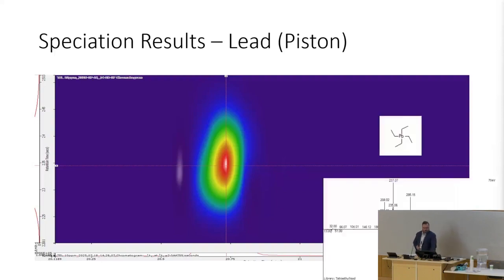It is, for its location in your chromatogram, basically one of the best peaks I've ever had to work with, because you're never going to confuse it with anything else. It's so early, because it's got a low boiling point, but its structure is just so different. When you look at the mass spectra, you have your molecular ion and then you just have lead losing ethyl groups in these really, really defined peaks. So it's super, super nice. It's super, super easy to find. It really sticks out for its boiling point.